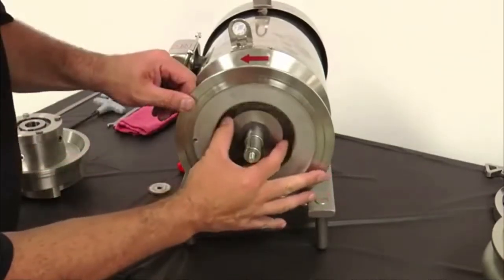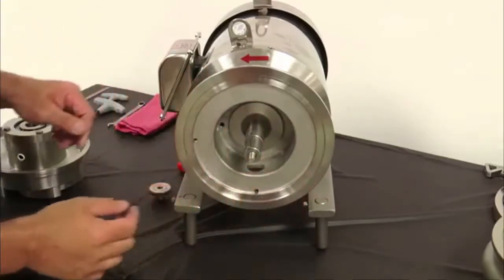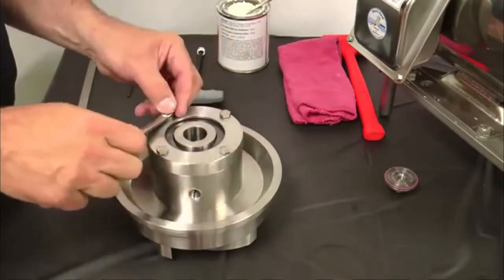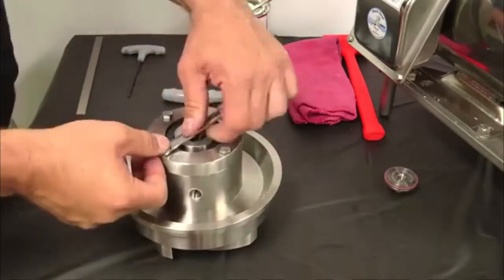Locate the motor shaft shims and ensure they have not fallen off the shaft. Remove the plug from the side of the seal housing using a quarter inch Allen wrench. Remove the four hex head screws from the back of the seal assembly using a 7/16th inch wrench.